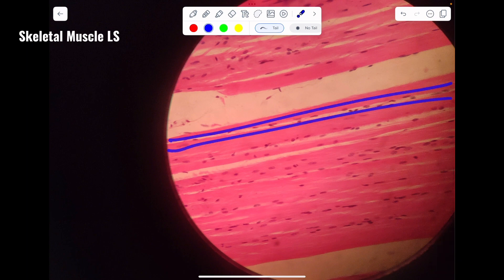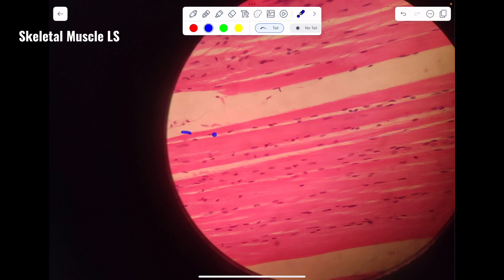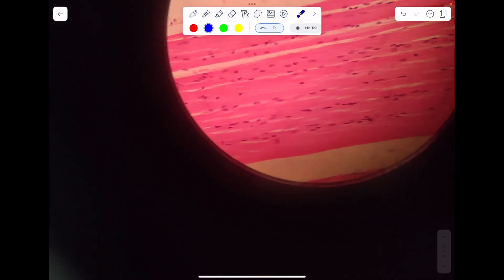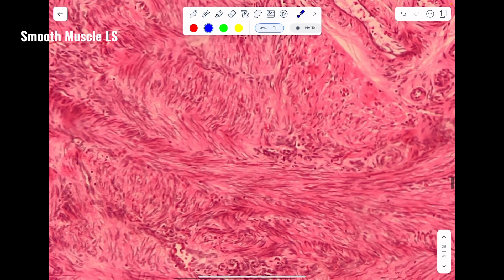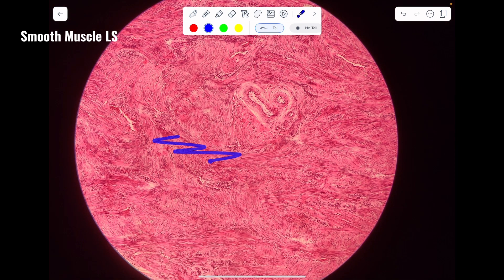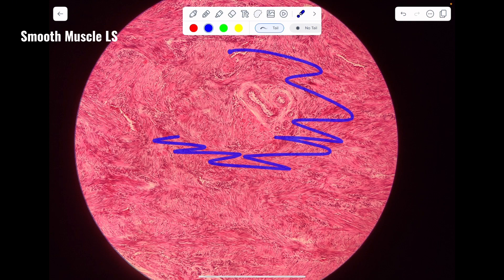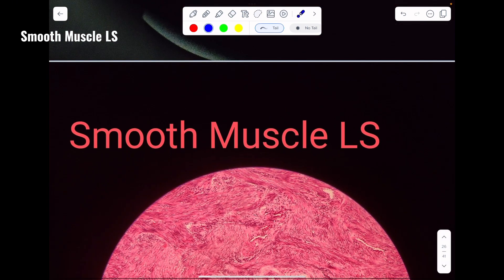Here you can see skeletal muscle fibers that are unbranched, multi-nucleated, and the nuclei are present at the periphery. So this is obviously the longitudinal section of skeletal muscle. Here you can see that individually the muscle fibers are spindle-shaped with an elongated nucleus; overall the arrangement is very messy — so this is smooth muscle.